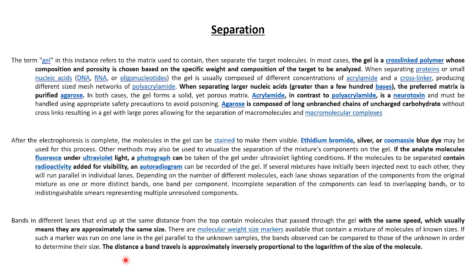It's a very important question because I do not know in which fields you are or in which stage of your education you are, but in many interviews and in many exams they do ask whether you can tell the exact molecular weight of a protein from an SDS page, and most of the people say no.